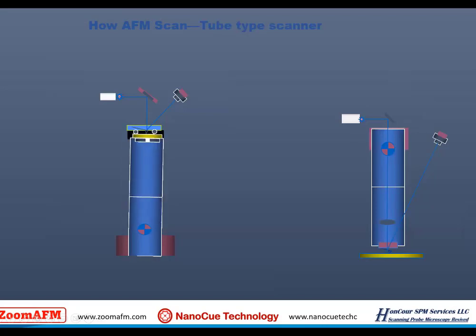And here are some drawings of a sample scan instrument, a tip scan instrument. So you notice I have a line here. That's because these scanners always have 2 portions of the piezo, and 1 portion acts as the XY, which you apply voltage of opposite sign from the opposite sides, so the piezo tube will bend. And on the other section, you apply voltage universally, so it'll contract, expand. Now imagine, if you want a long range piezo scanner, your tube will need to be longer. So you see in all the older designs, you have very long piezo tubes.